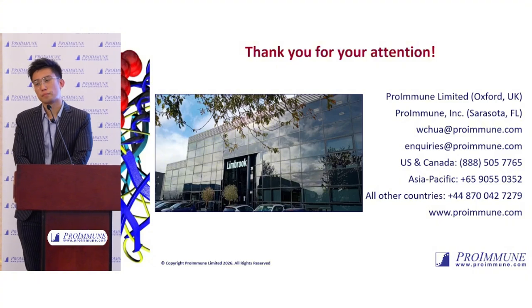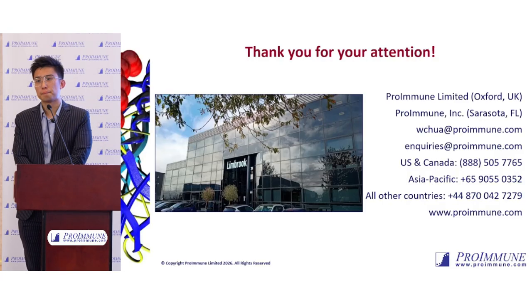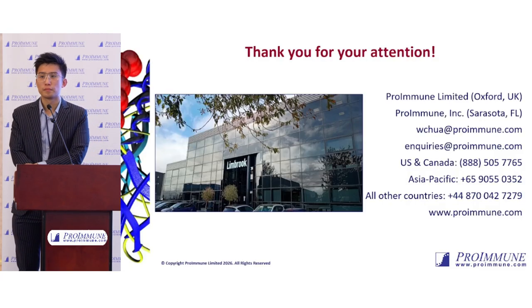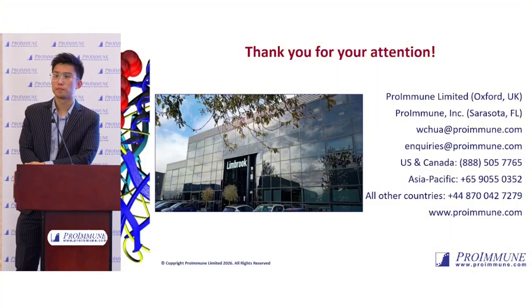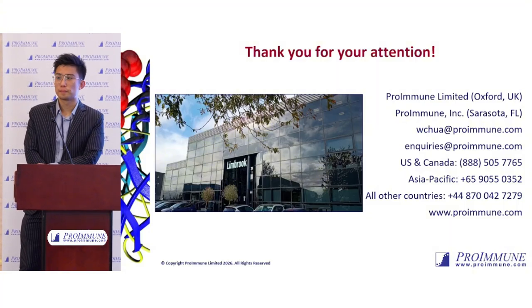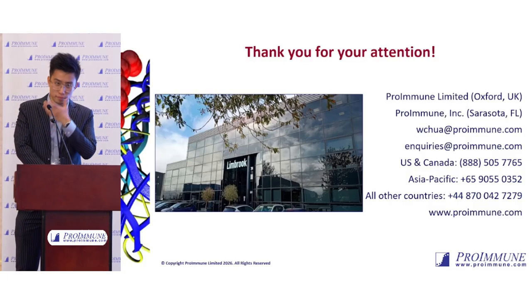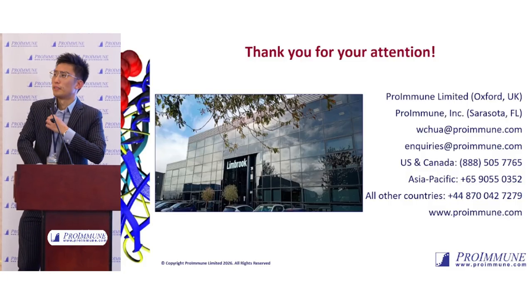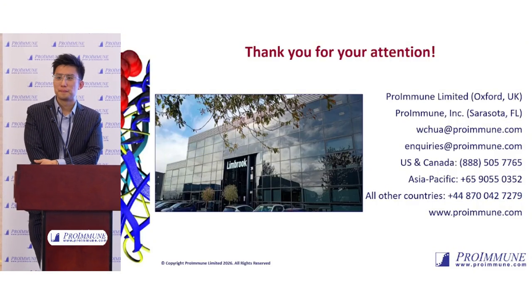The first thing is to understand whether you have a problem or not, which I think this assay does quite well. After that, you need to do a root cause analysis, and that may require some additional testing. It's going to depend a lot on what your product is and what platform it's made in. Again, you have to understand the whole product and the whole process to really go fishing for what's wrong and what's going on.